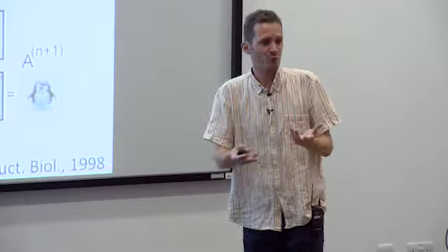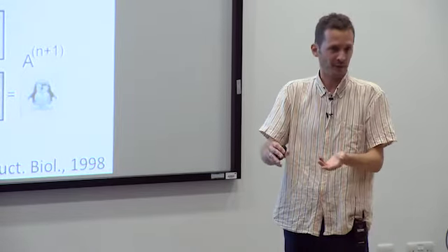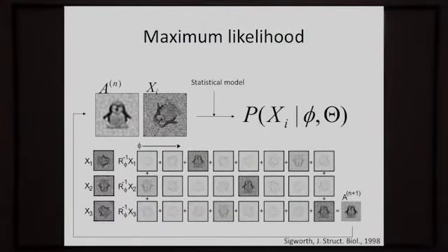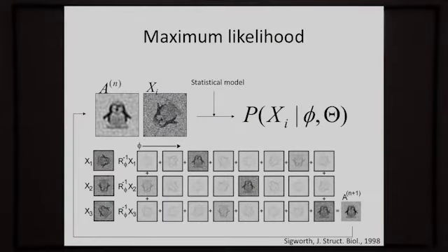So that might give a reasonably good fit, which is not as good as the upside up fit, but perhaps when the noise is so large in the image, and that's a crucial point here, then it becomes very difficult to find a difference. But at this noise level, it's still quite easy, okay? So this one has a higher probability than all these in between, but it's perhaps significantly non-zero.